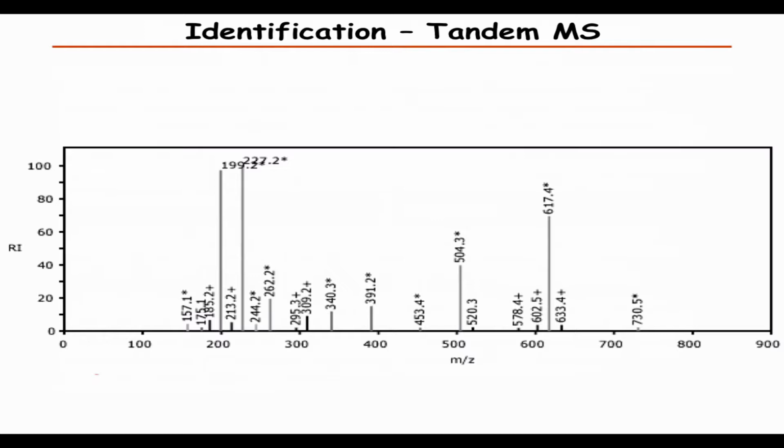While you do that, I'm going to talk about how to do this in a more manual way. Since we have a fragment mass spectrum, there are two ways to interpret it. First, we're going to assume that we know the sequence, and we're going to see if we can understand the spectrum and explain all the peaks.